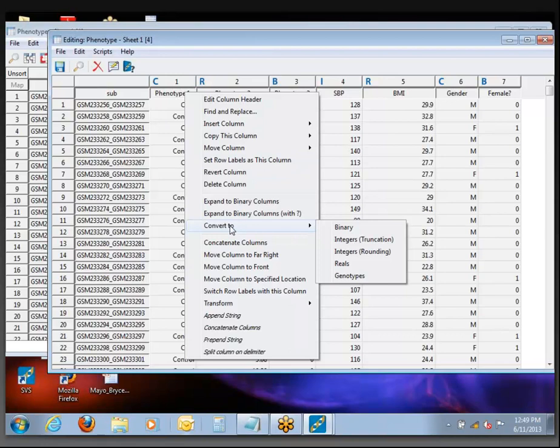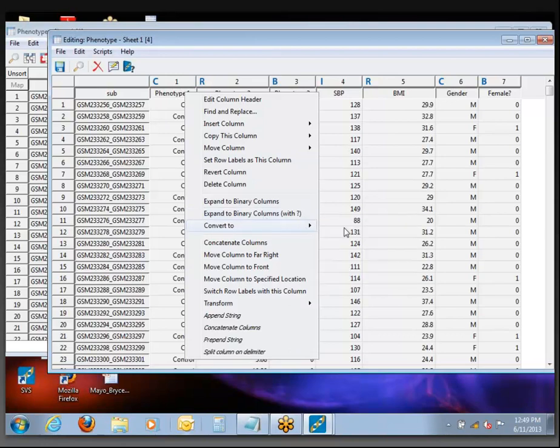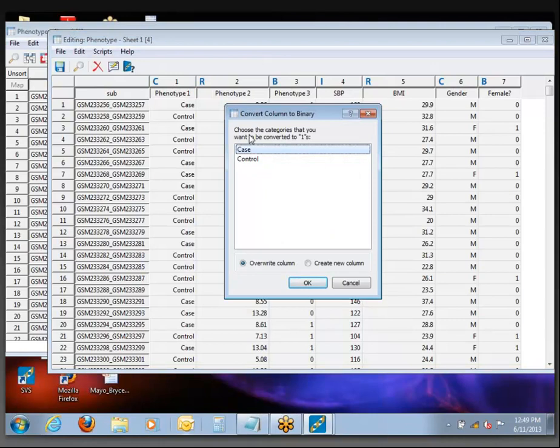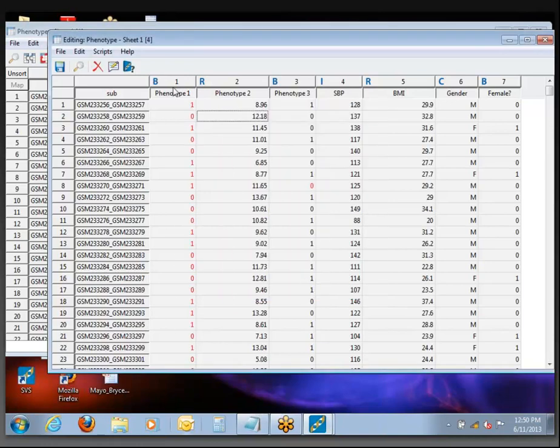If we come to the Convert To option and select binary, you get the choice of which categories you want to be converted to ones. If we had a more complicated variable with 3, 4, 5, or 200 different levels, we could go through and pick everything we wanted to be converted to ones — the rest would be turned into zeros. In this case, just select cases to be one and click OK. The tutorial says to use the option to create a new column instead of just replacing the values — we'll deal with that as we go along.